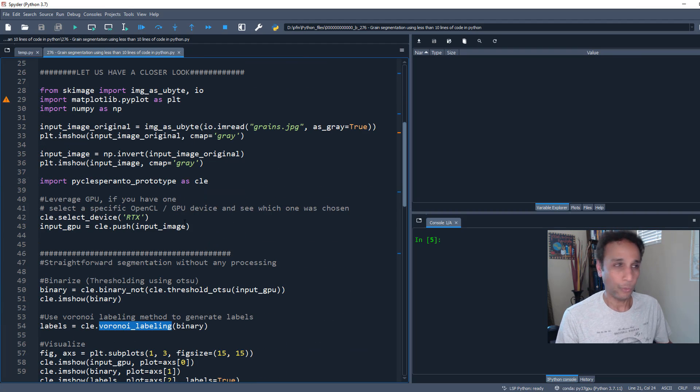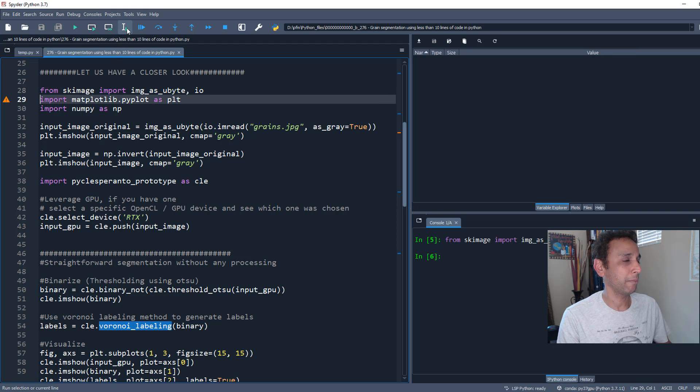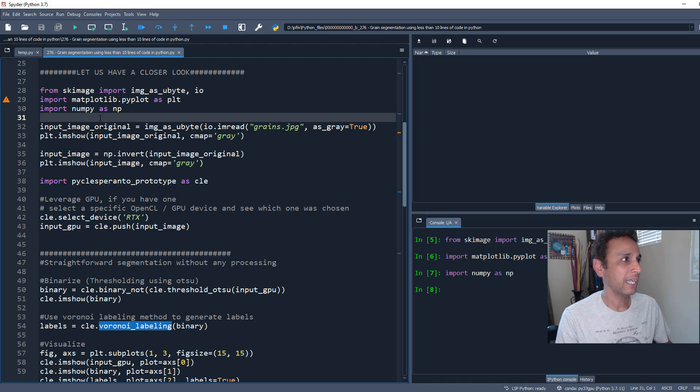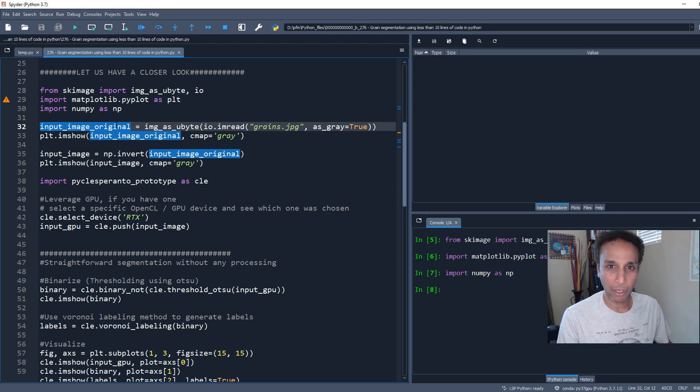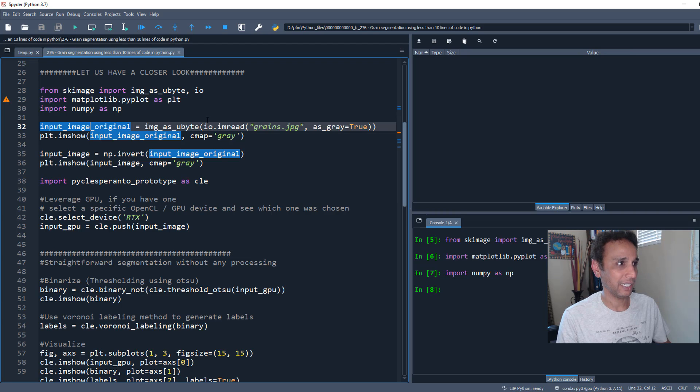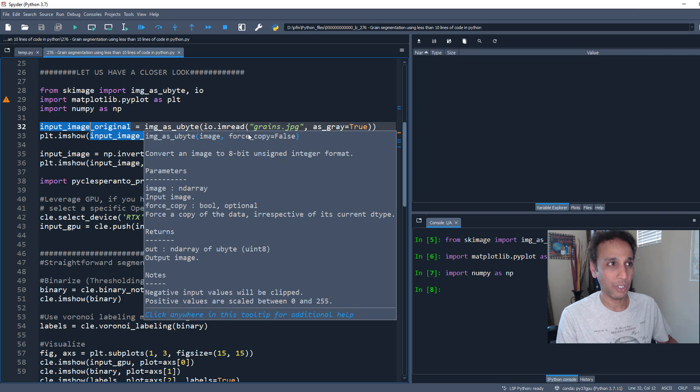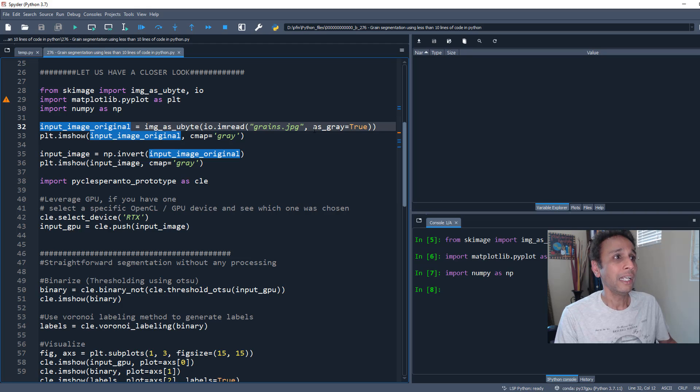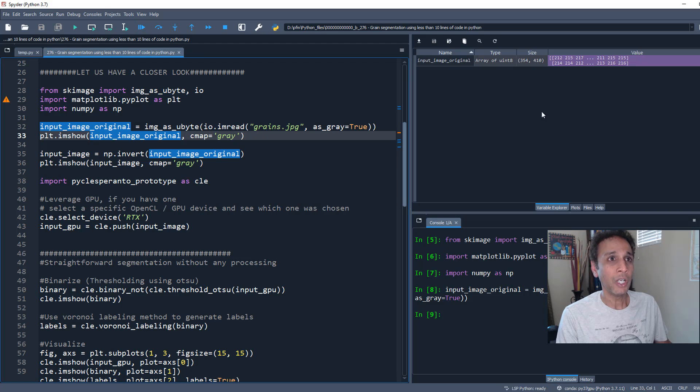How does this actually work? First, let's import our libraries: scikit-image, matplotlib, numpy. I'm importing my image that I downloaded from Google search and converting it into an 8-bit image. I'm reading it as gray and converting to 8-bit.